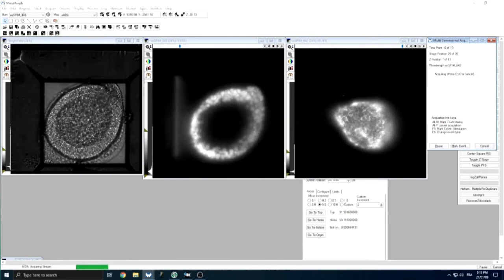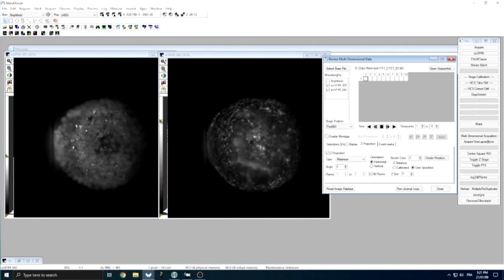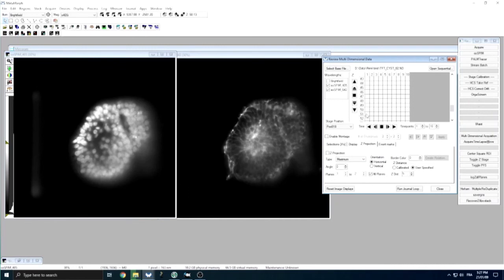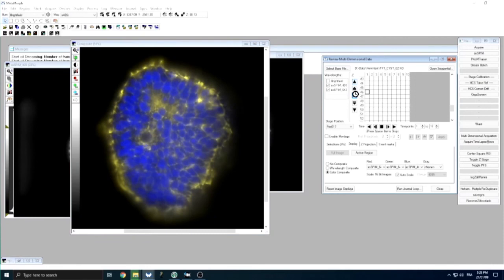Once the acquisition has finished, we can navigate through our dataset using already implemented tools in Metamorph before exporting for further treatment and analysis. We can check the image quality at all different positions and channels over time, and perform some basic image treatments such as maximum intensity projections and channel overlay, as shown here on some of the positions we just imaged.